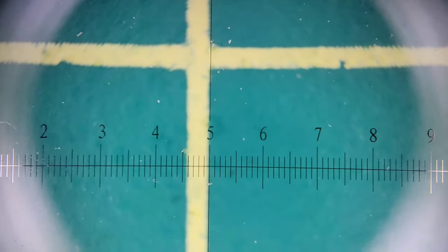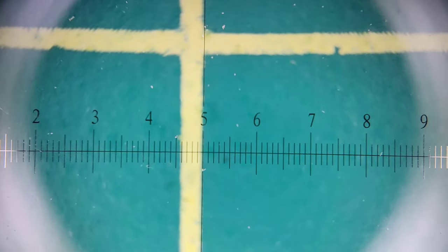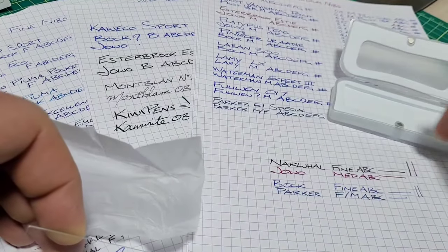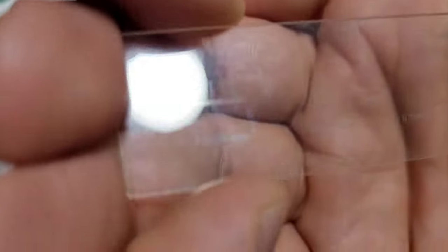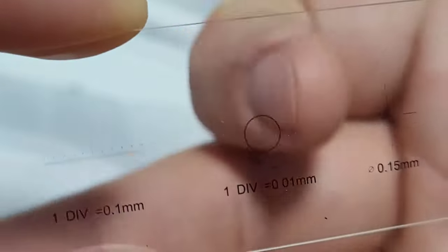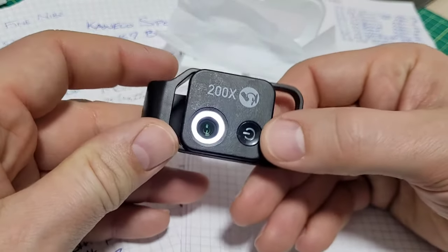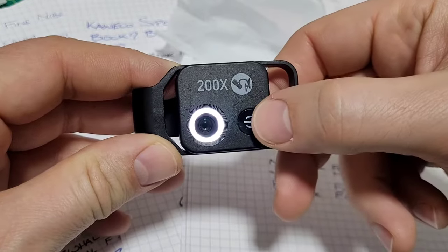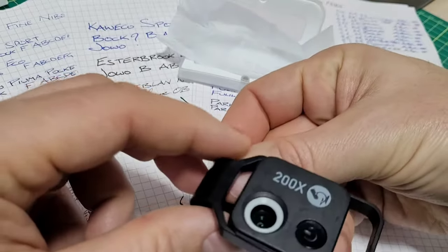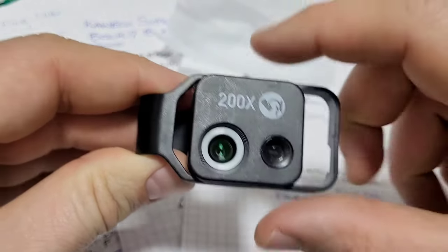A cool thing with this microscope is you can turn it into a measurement tool. I simply have a cheap calibration slot I bought off AliExpress, and now we can see this line here on my healing pad is 0.4 millimeters wide. This is what I was using the other day when I did measurements on 47 nibs — measured all the line widths — so we can have a measurement. It's just got some divisions, 0.1 millimeter increments — super cheap, picked mine up on AliExpress. Overall, I'm pretty impressed with this little thing. For the price — I think it's in the neighborhood of $35 or so — you're getting a really nice clear picture. That's the benefit of the caliber of image we get through our smartphones. This whole channel is done through a phone, and I can quickly turn my phone and have some nice magnification.